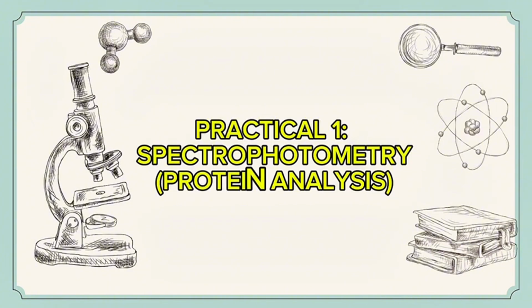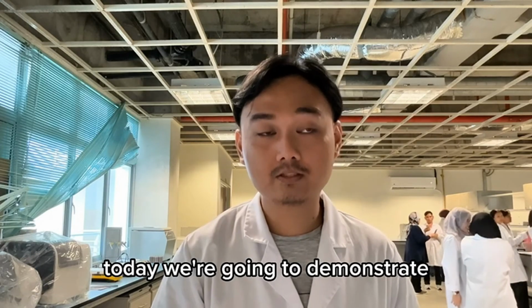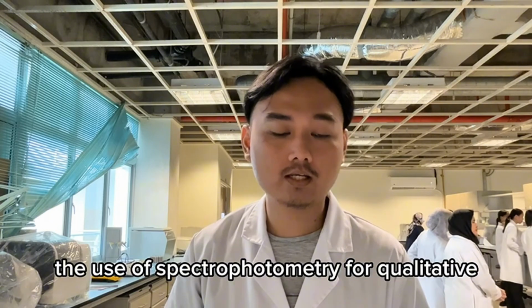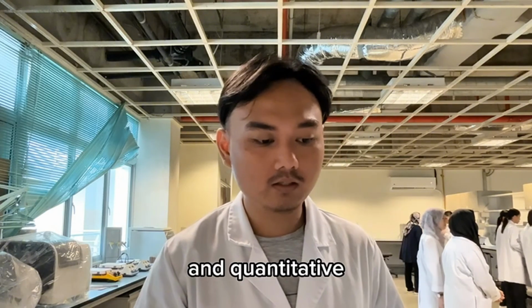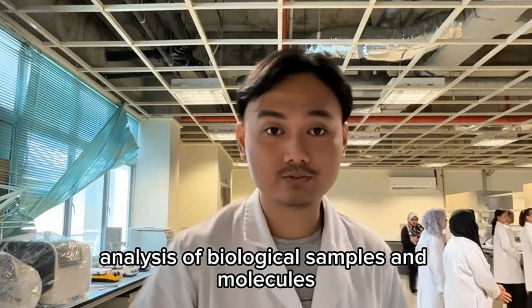Practical 1, Spectrophotometry, Protein Analysis. So today we're going to demonstrate the use of spectrophotometry for qualitative and quantitative analysis of biological samples and molecules.